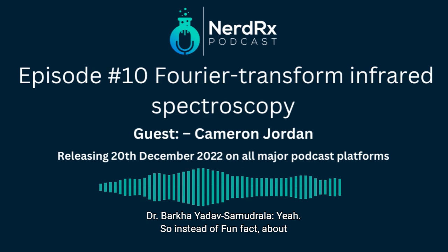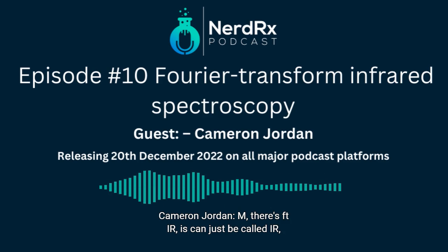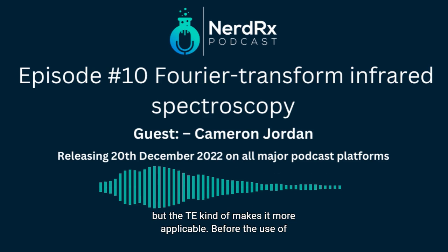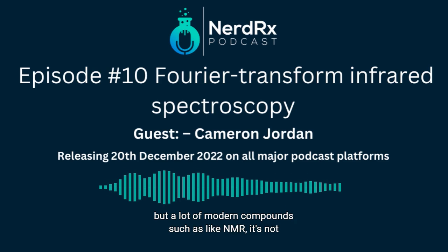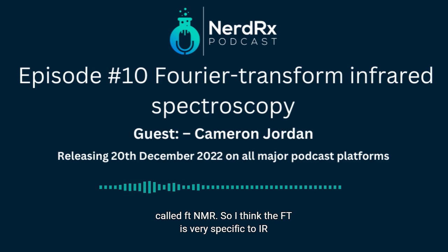So, is there a fun fact about FTIR? FTIR can just be called IR, but the FT kind of makes it more applicable. Before the use of Fourier-transform, it was very hard to interpret the spectra, but with a lot of modern techniques, such as NMR, it's not called FT-NMR. Correct. So I think the FT is very specific to IR.